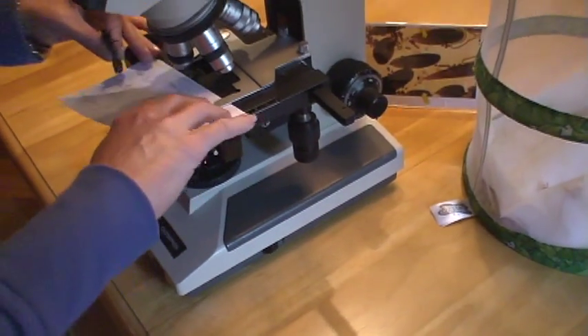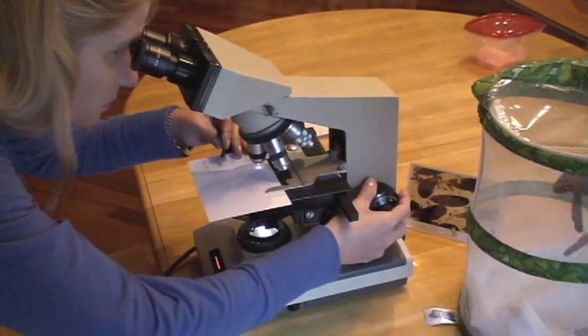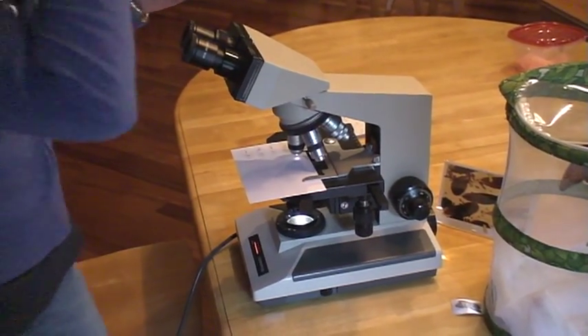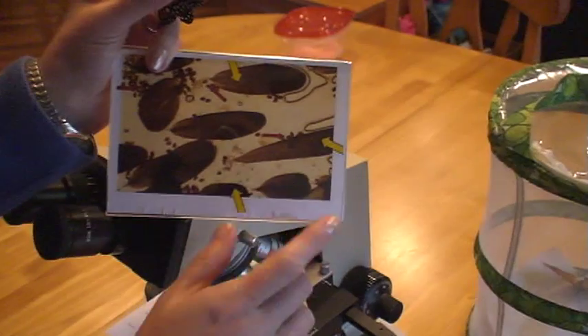Then I look under a microscope to see if I can see the parasites. I don't see any parasites. Since I can't show you what it looks like under the microscope, I can show you on this picture.